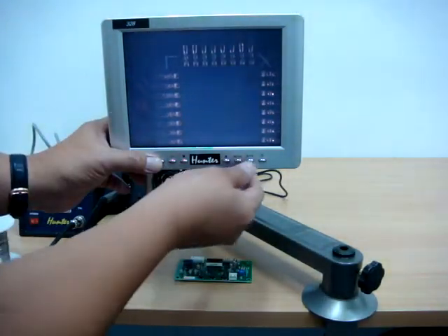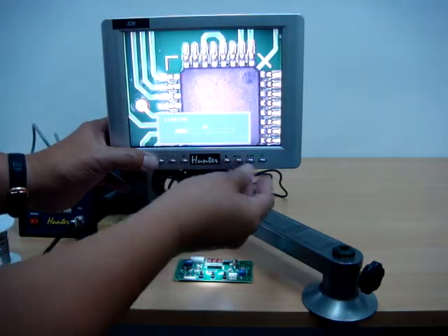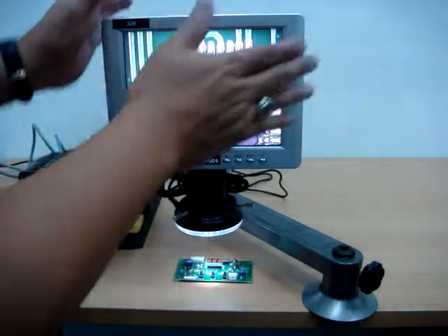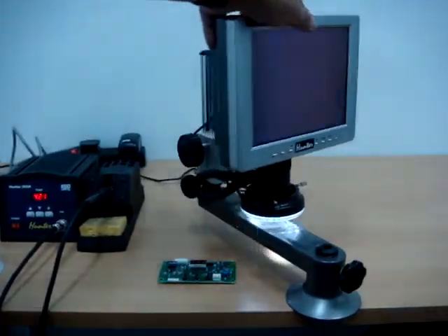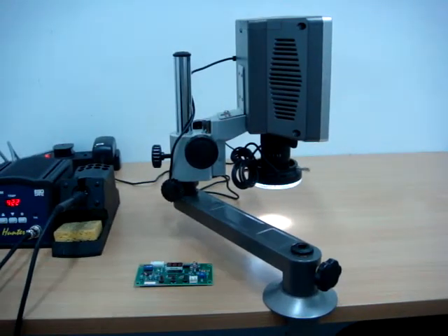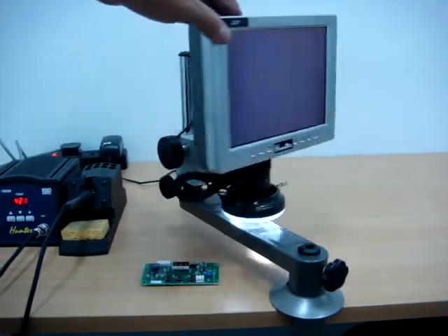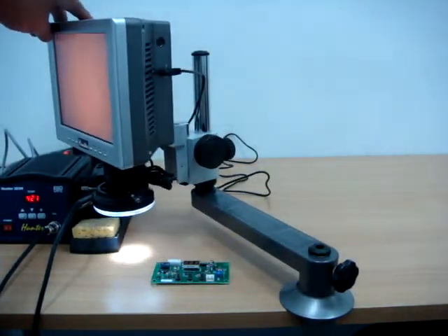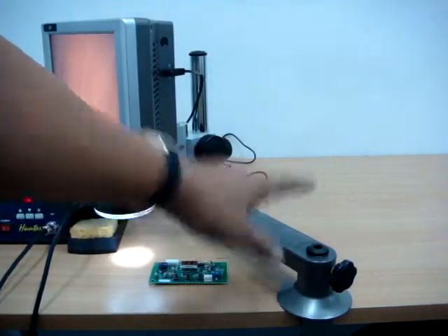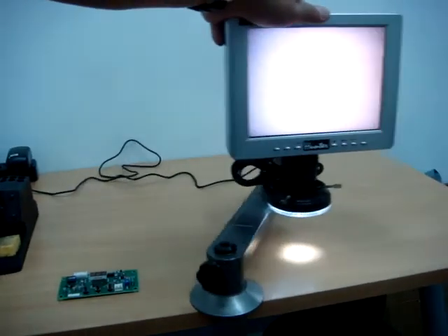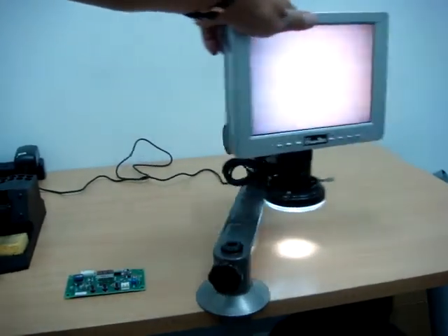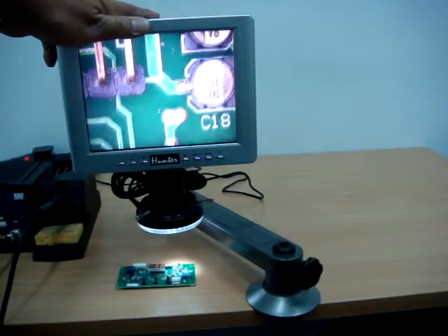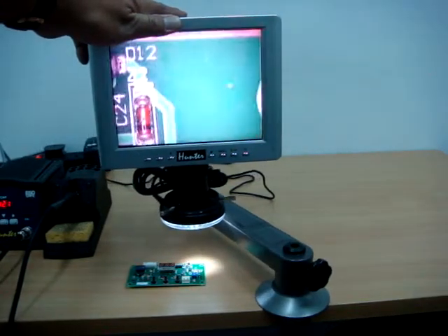You can rotate the head and swing left and right up to 360 degrees. Furthermore, this shaft can also move, so you can turn it for left-hand or right-hand users on any side.